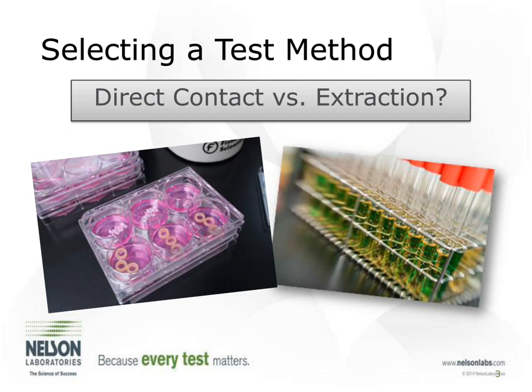And then the other versions of the three tests are an extraction, where we take the device and we'll put it into some kind of liquid medium. And we'll allow that liquid to extract off chemicals that could either be cytotoxic, sensitizers, or irritants. And then we take that liquid, that soup, and we apply it to the test system, be it cells or the animal.